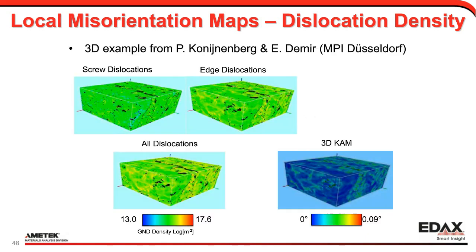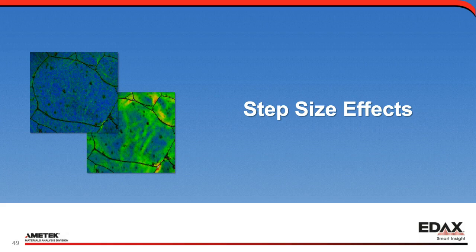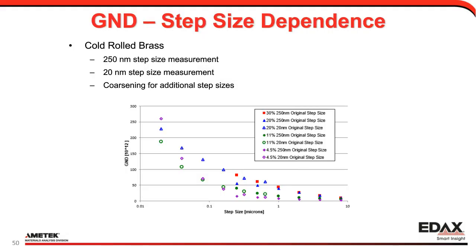What are the step size effects? Here are some experiments on cold-rolled brass, done at 250 nanometer and 20 nanometer step sizes, then coarsened to pick up other step sizes — covering 30%, 20%, 11%, and 4.5% cold work. The measured GND density from EBSD measurements goes up as the step size goes down. So it's clearly step size dependent. You can see that in the KAM results: the nearest neighbors on the left are pretty noisy because at the smallest step size, the misorientations are small and I'm starting to reach the limits of EBSD precision. As I go to larger step sizes, the misorientations tend to be larger and I pick those up more clearly, getting cleaner results. Nonetheless, you can see some of the same features develop regardless of step size, even though the magnitude differs.